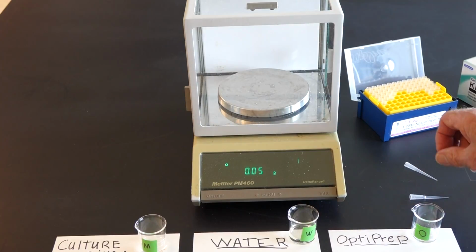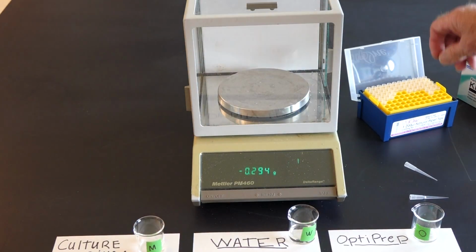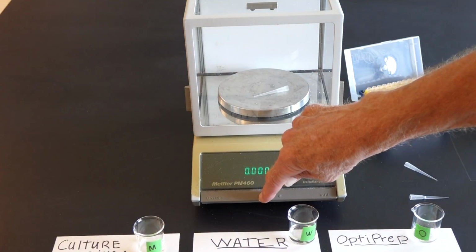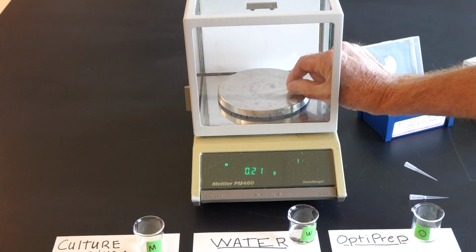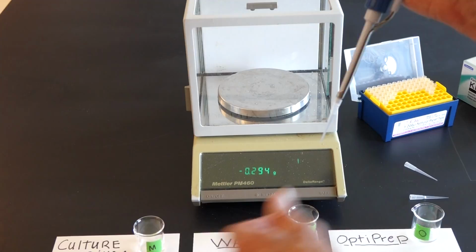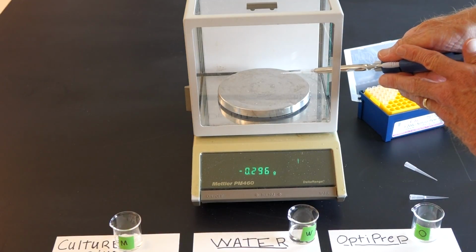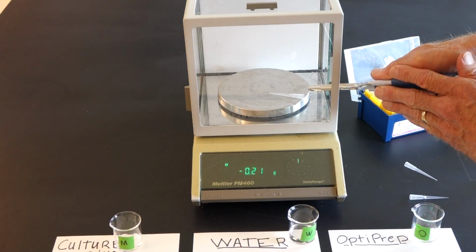Now I'm going to try an unknown. This is a culture medium that I use in my work. Again, I'm going to take a fresh micropipette tip, place it on the pan, tare it to zero, pick it up, place it on the micropipettor, and pick up exactly 100 microliters of my unknown. I'll see if I can get it on the pan without scooting it across to the other side. Here we go.